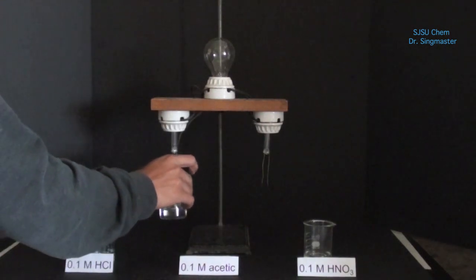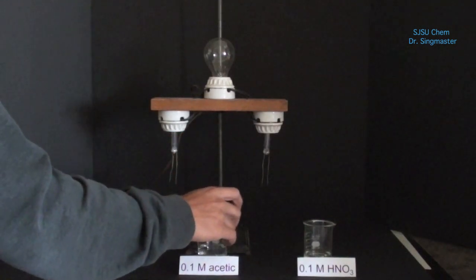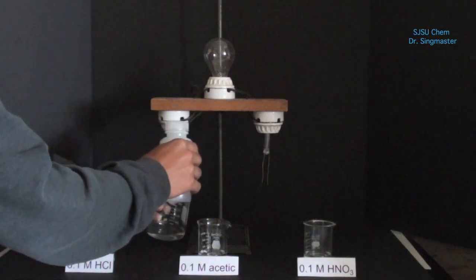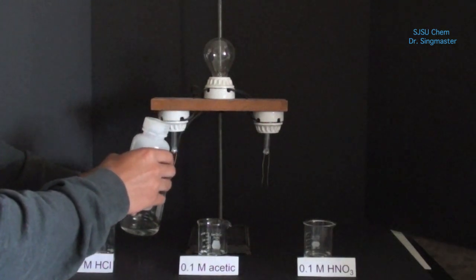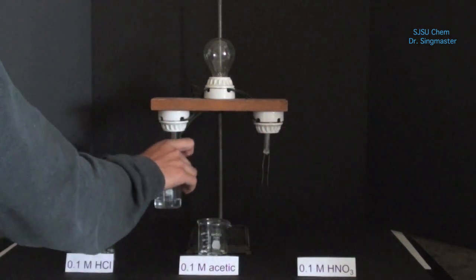Now we're testing a solution of acetic acid. Finally, we're testing a solution of nitric acid.